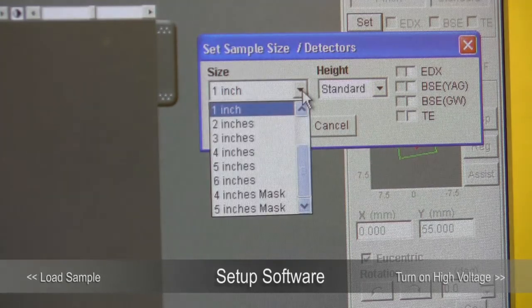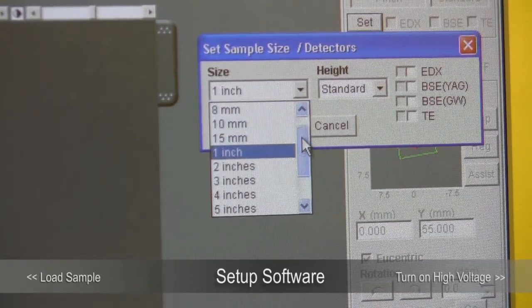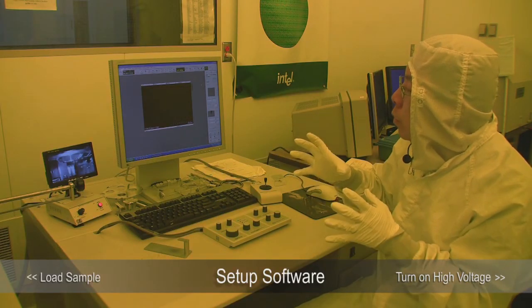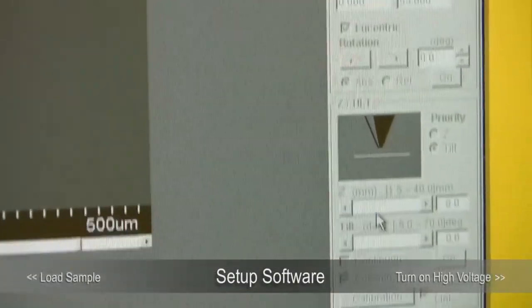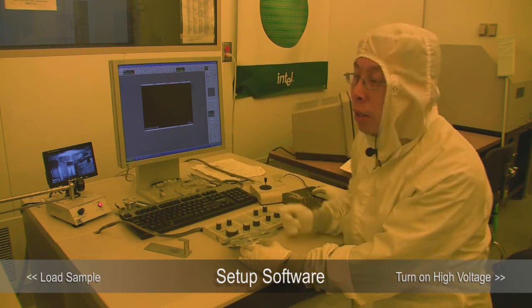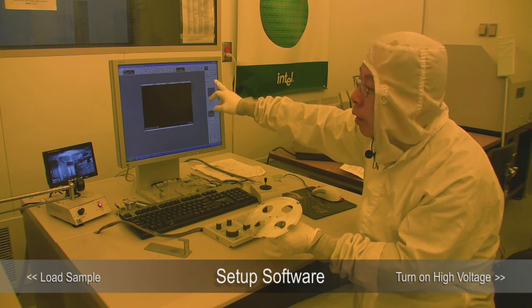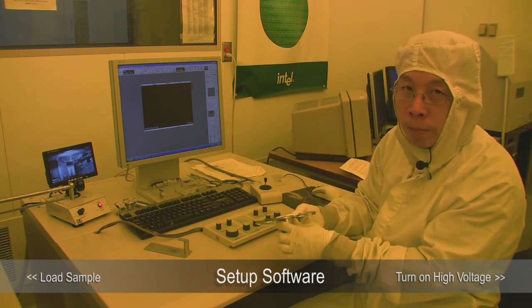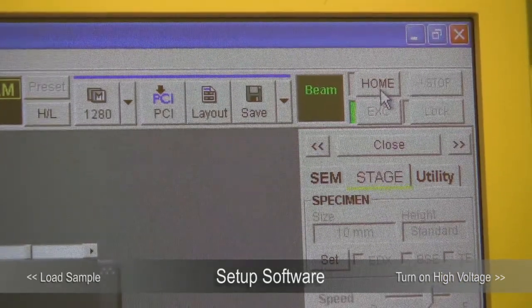We set it at standard height and choose standard height. The size refers to the diameter of your sample plus your sample holder. The one we put in is a 1 cm sample holder, and since the sample doesn't extend beyond the holder, we will choose the 10 mm option. The software needs to know the size of your sample holder in order to tell you what tilt angle is allowed. A 1 cm sample holder will be allowed to tilt more without hitting the objective. Make sure you set the sample holder size to be larger than or equal to the actual size you put in, then click Home Position.